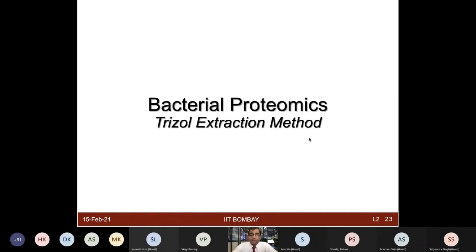I think the good thing is, if your lab has not worked in proteomics earlier, and you have no prior background and idea of what is the best workflow for doing proteomics in your lab, it's a good idea to first try out different types of extraction methods, and see which one is easier and also provides high quality sample on the gel and good yield and quantification, looking at the different types of quantification methods.